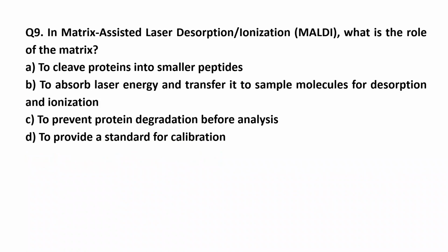In matrix assisted laser desorption ionization, MALDI, what is the role of the matrix?